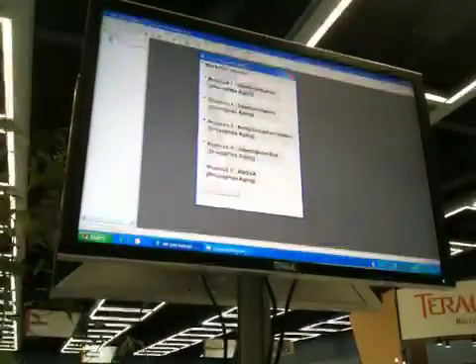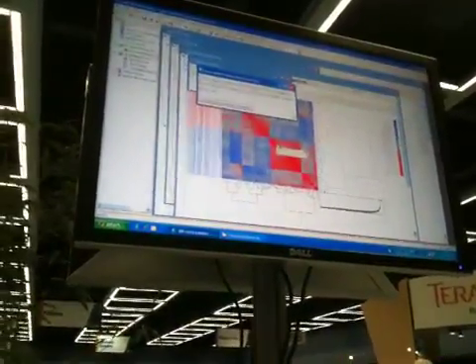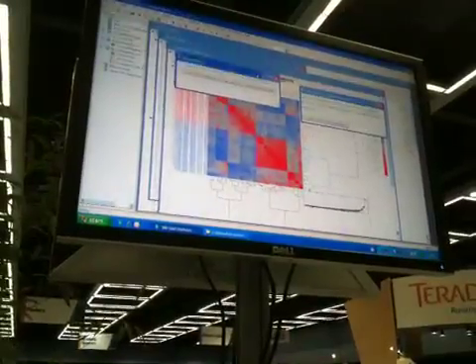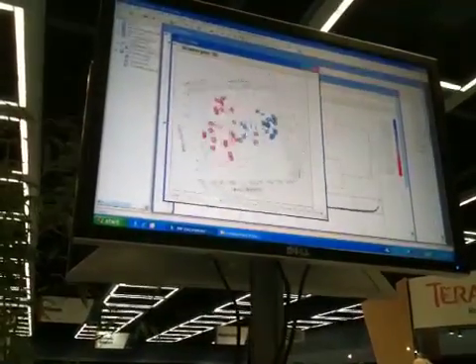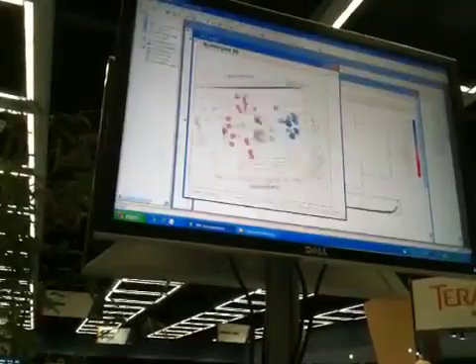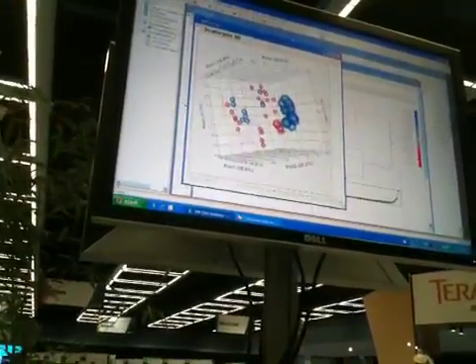Let me go to the next one. Then one of the next ones was again a quality control thing where we're looking at the correlation of the arrays across all of our samples. And again, we have different drill downs that you can use to guide your analysis. We also again are taking advantage of JMP's 3D scatter plot, which is a nice interactive thing, and it still has the capability to do selections.